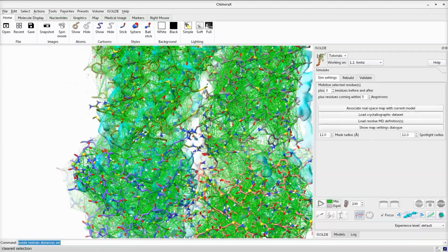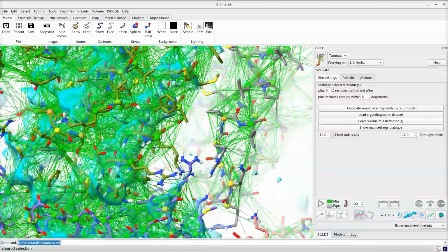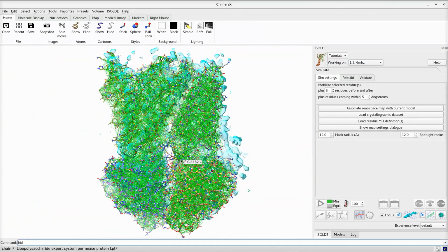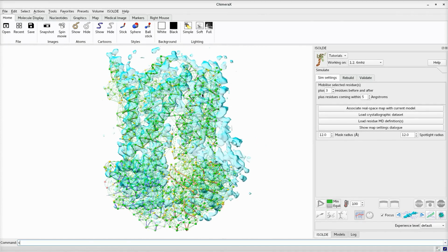Taking the first three heavy sidechain atoms of each residue, each atom is restrained to others within an 8 angstrom sphere. These restraints are adaptive in the sense that they only restrain strongly when the interatomic distance is close to the target, so that conformational changes may still occur where needed while still maintaining local geometry.